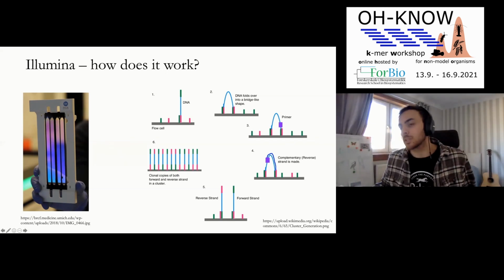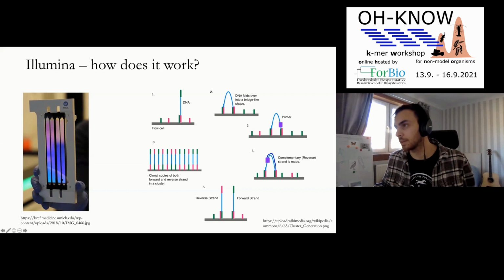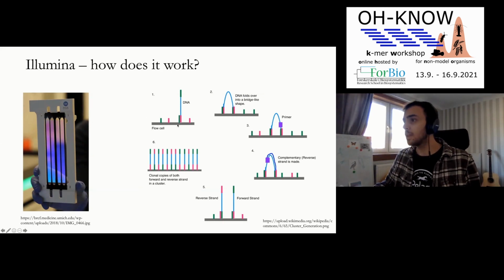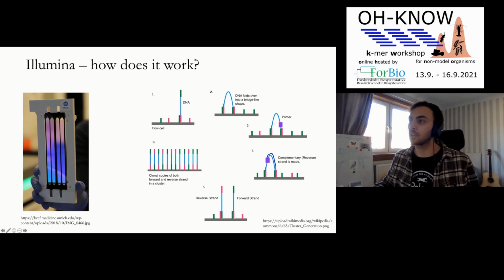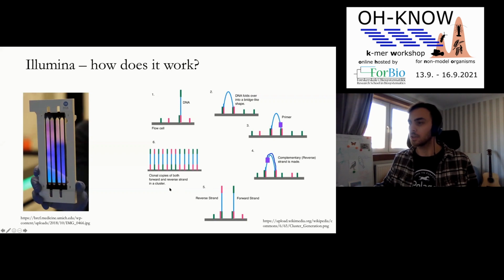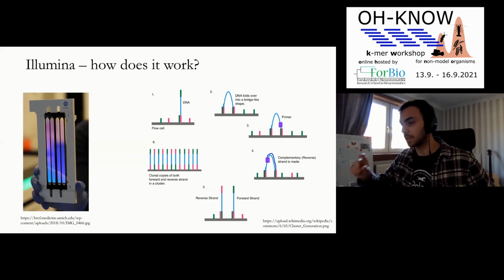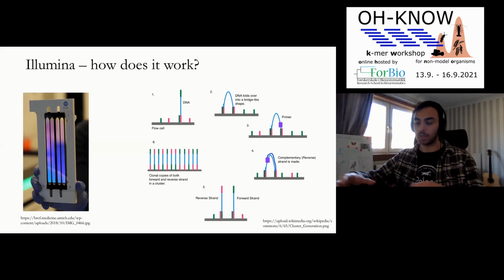Illumina is pretty amazing because you have a flow cell like this, which has this textured matrix on here, which they're always improving. That matrix has different oligonucleotides attached to it. Your DNA fragments that you've already extracted and cut up will bind to these oligonucleotides with the Illumina primers that you've attached. The DNA is then folded over, and you synthesize DNA, this complementary strand, as it goes. You then end up with these two strands, and in some protocols this reverse strand is washed off. But what ends up happening is you've essentially grown a small patch of that sequence around the area. So from one initial DNA strand, you've synthesized a big clump of it.